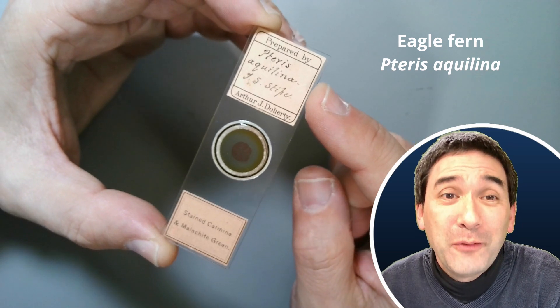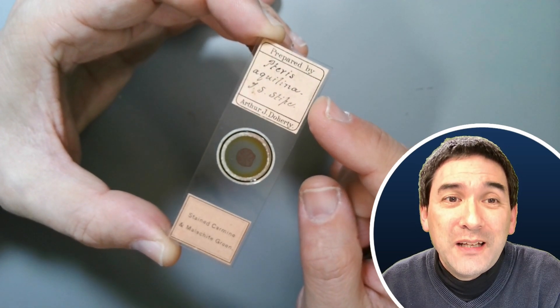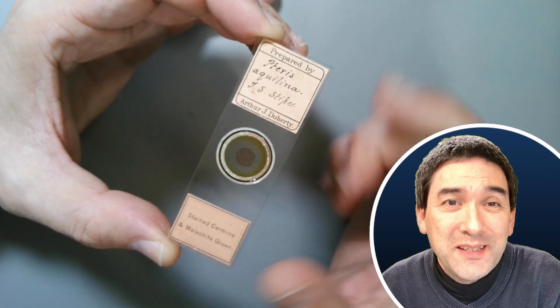The Latin name, the binomial name of the fern is here, Pteris aquilina. That's the name of the fern and the stipe, the transverse section of the stipe, that is the stem.